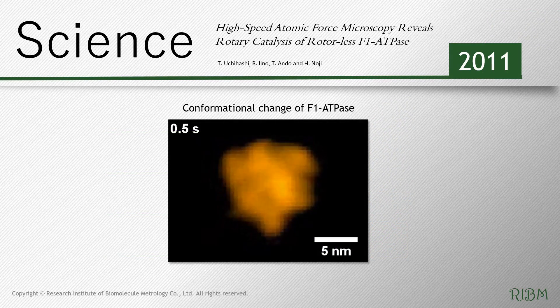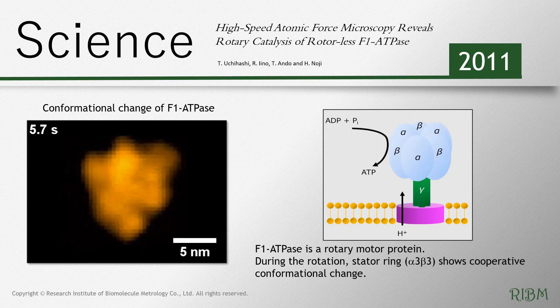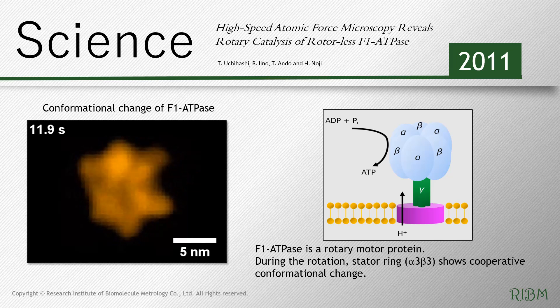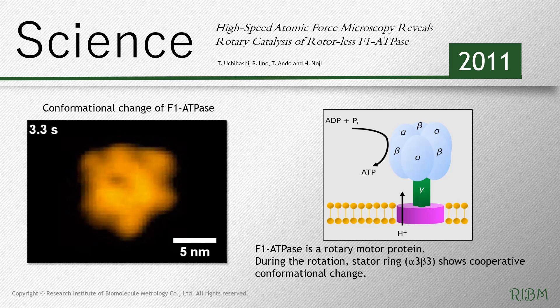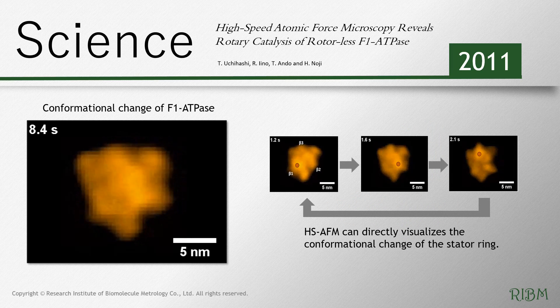The video shows the conformational change of F1 ATPase. F1 ATPase is a rotary motor protein which consists of a rotor subunit and a stator ring. During the rotation, the stator ring shows cooperative conformational change. High-speed AFM can directly visualize the conformational change of the stator ring.